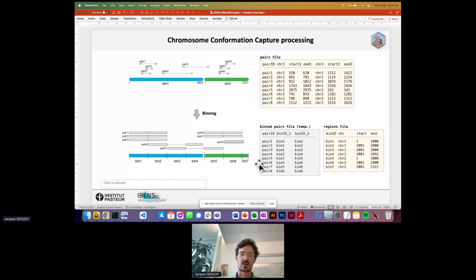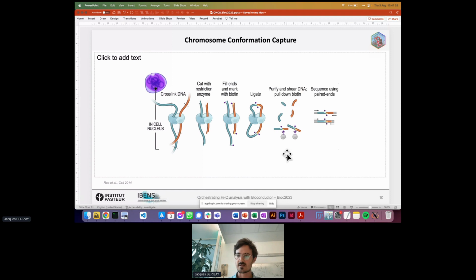One thing that is being done is, when you have these chimeric reads here, sometimes you have multiple restriction sites present, so you have multiple religation events, and you end up sequencing multiple religation events. This problem can be tackled using iterative mapping.